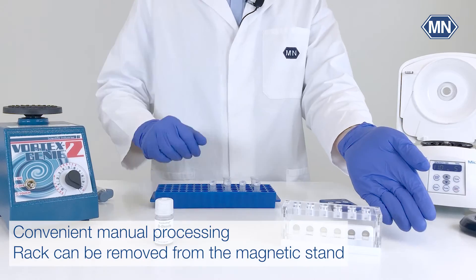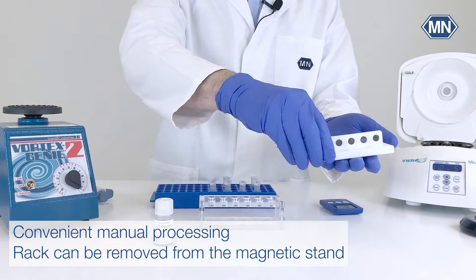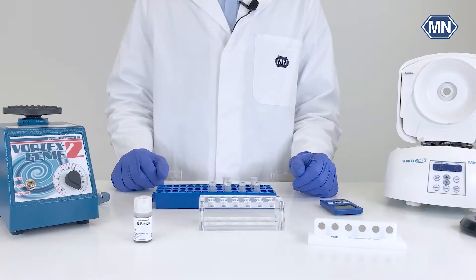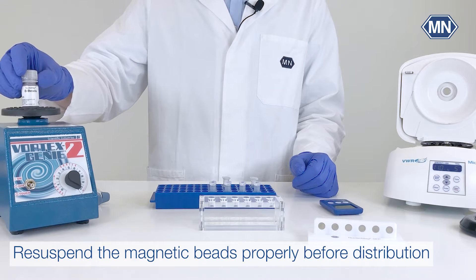The Nucleomag ZEP Mini allows convenient manual processing, as the rack of the magnetic separator can be removed from the magnetic stand. Before distributing the magnetic beads, please make sure that they are properly re-suspended to ensure a homogenized distribution to each tube.